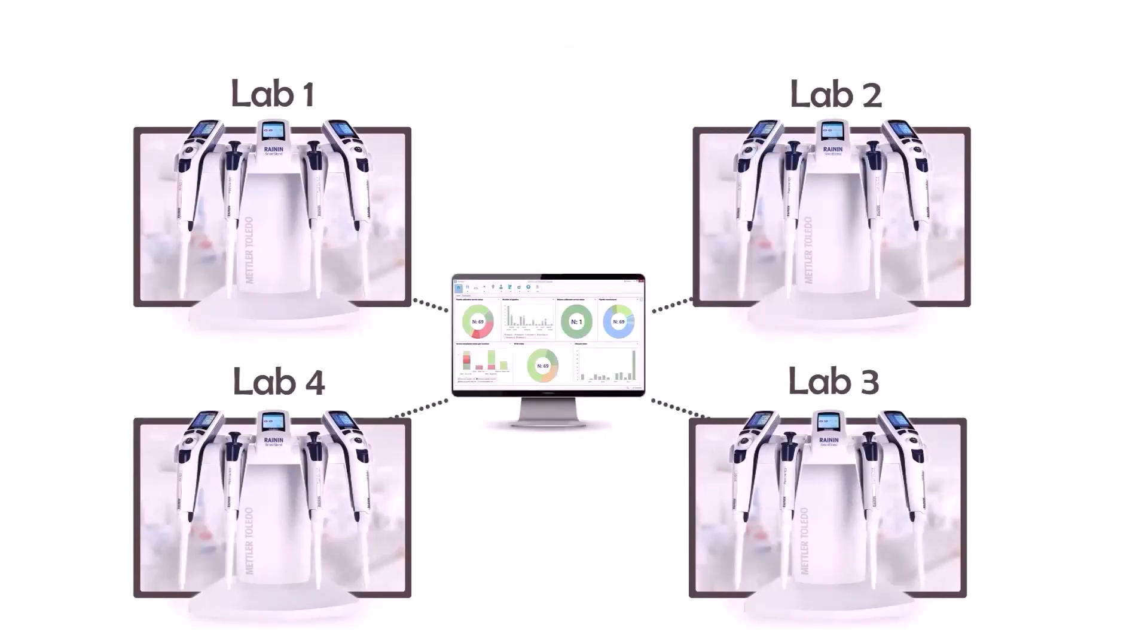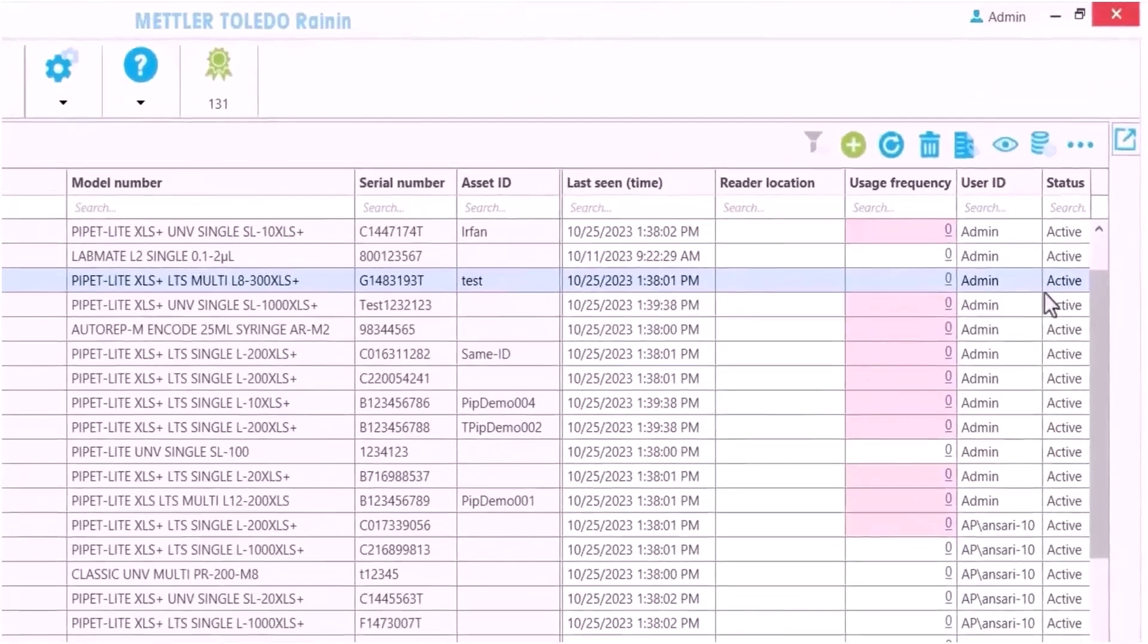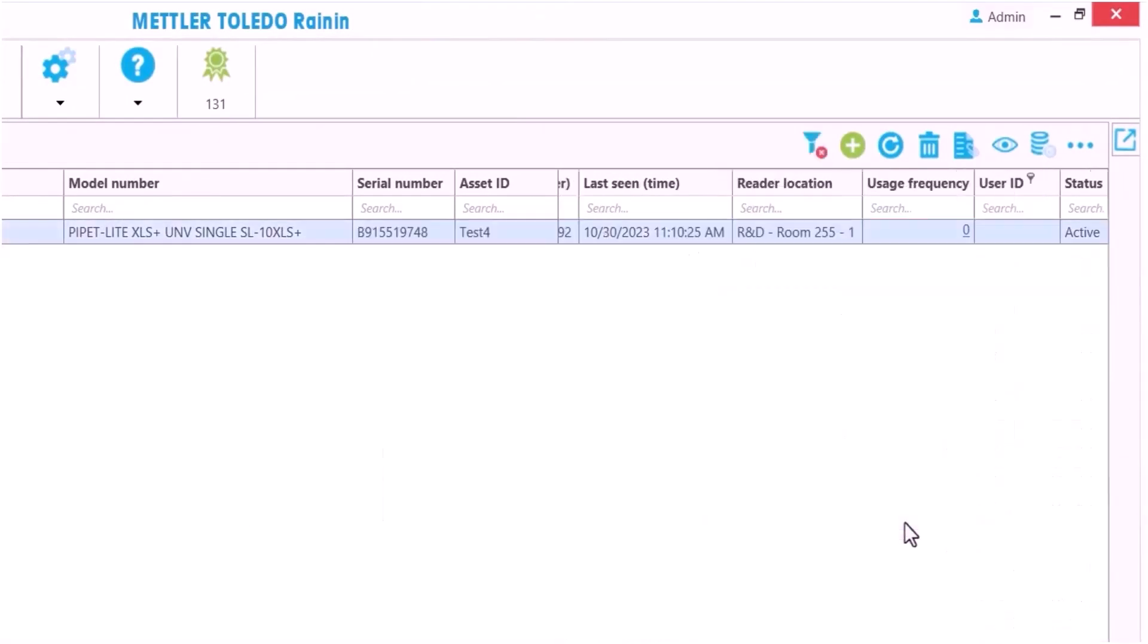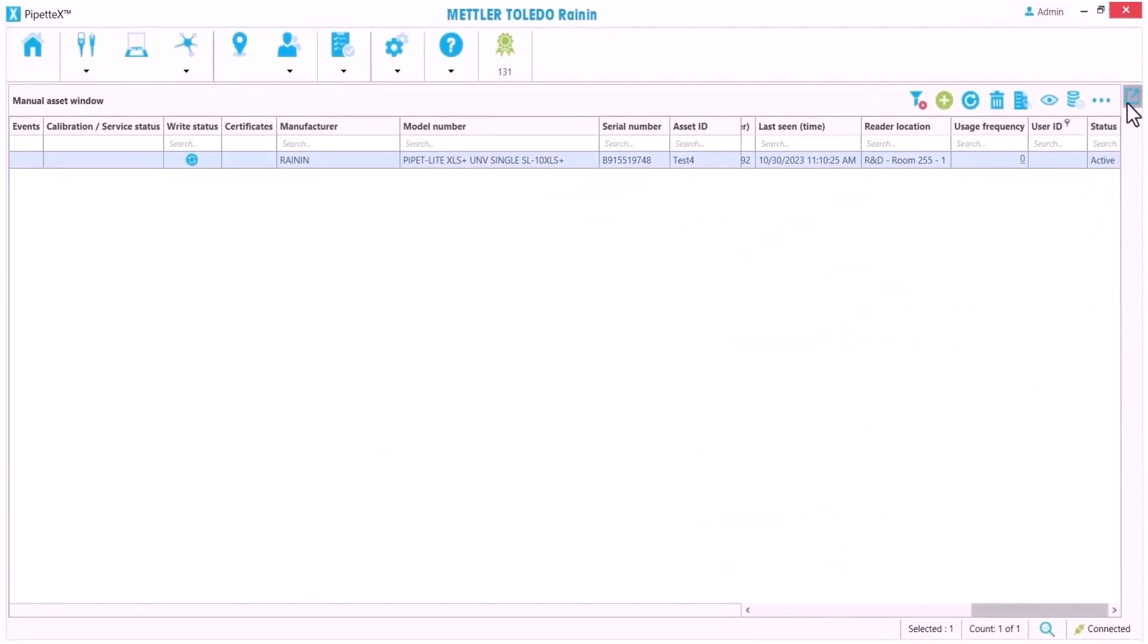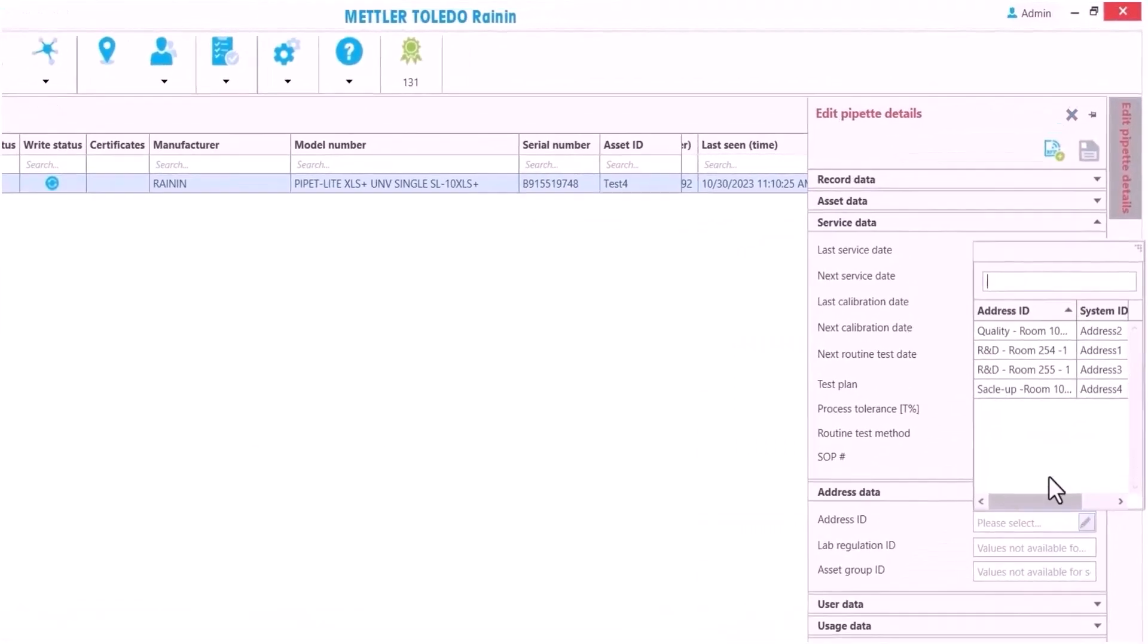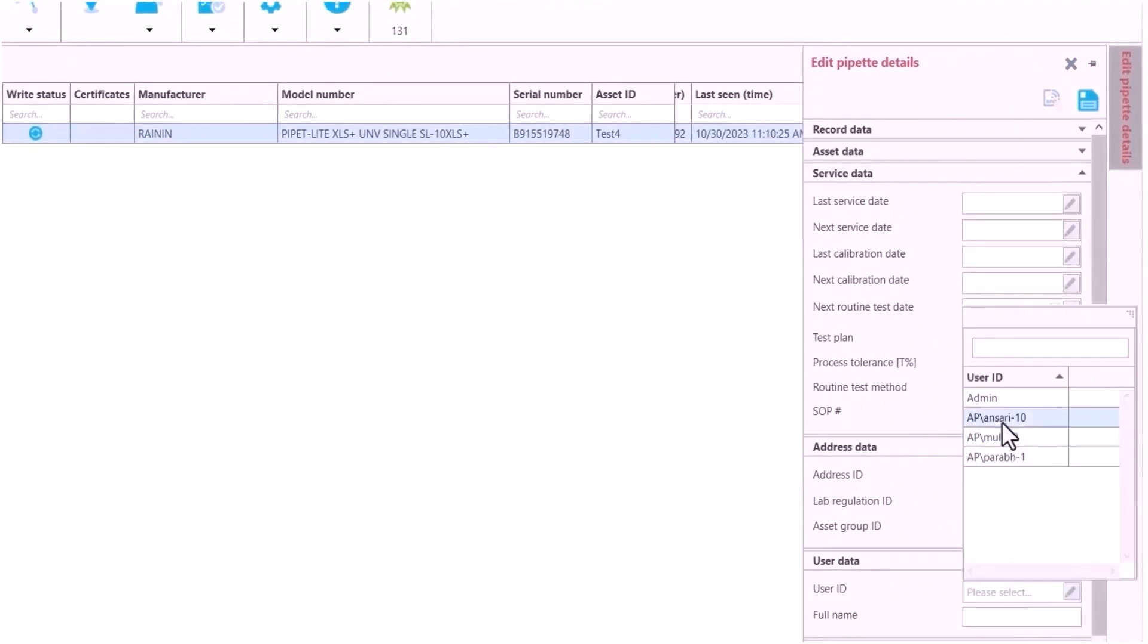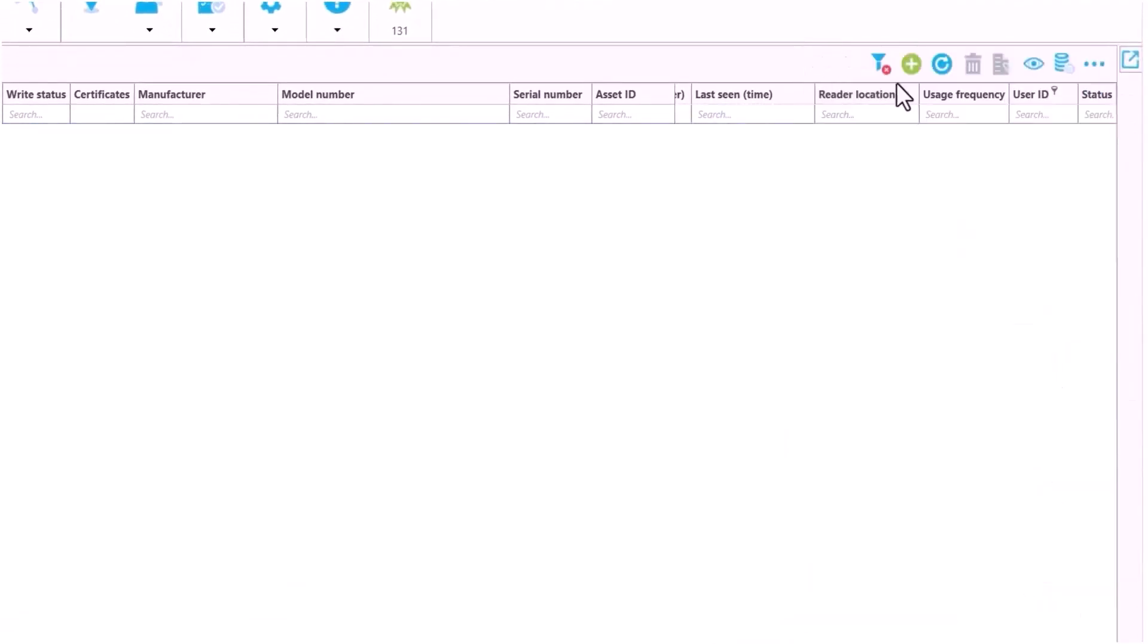I can find any recently added pipettes by filtering by pipette user. A blank means it's a new pipette. I can see where it was added, in this case R&D, so I will assign it to the R&D lab, give it a user, and save. Now it's part of a group I can sort and manage within our entire pipette inventory.